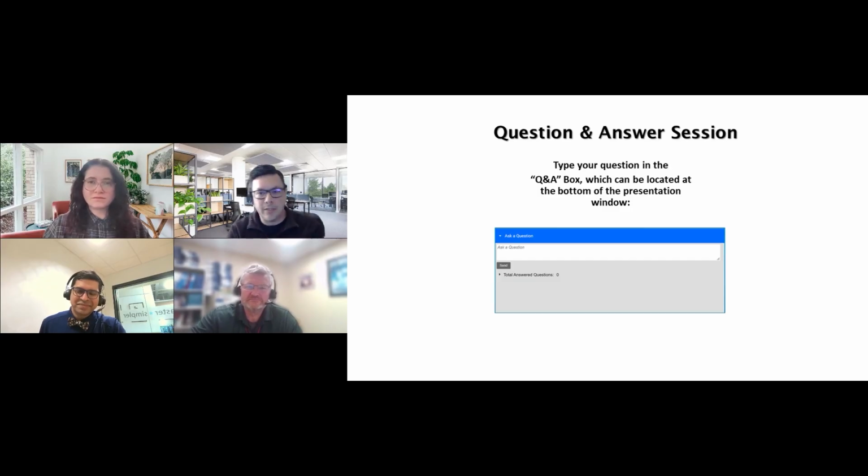Because they typically serve as a warning sign when a column needs to be replaced, having a column that resolves these two peaks better for a longer period of time means that we would have decreased the amount of maintenance around the lab or in the instrument. So that means that will boost performance. Also, a lot of the methods do require some sort of resolution between these two. Some are 25%, some are 50%. So if we could maintain that resolution for a longer period of time, it allows us to run the system for longer and not have to break the vacuum and change the column more frequently.